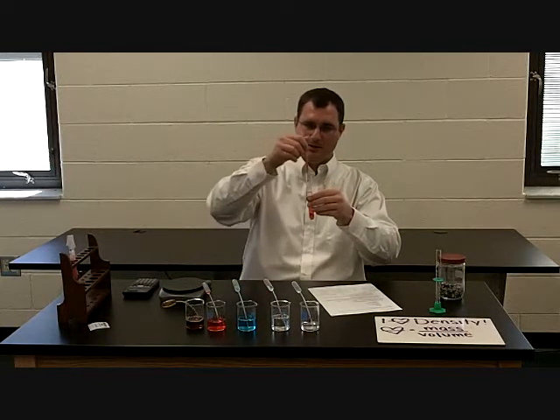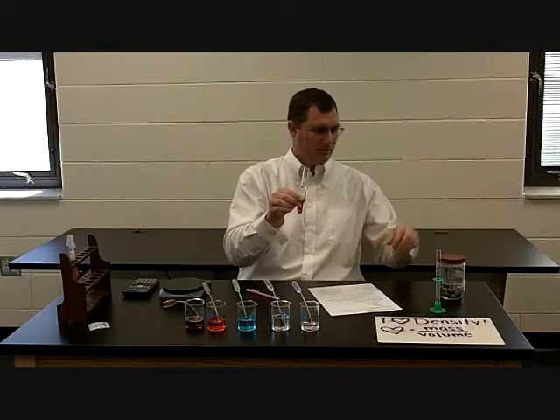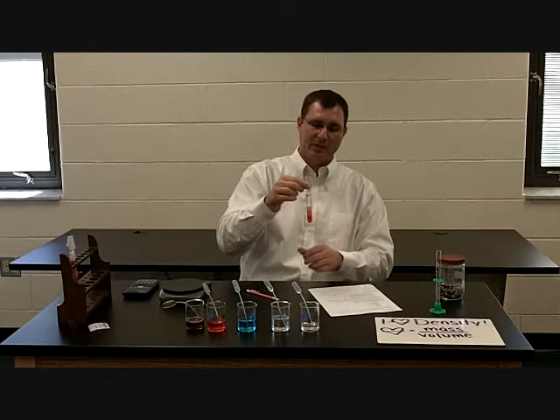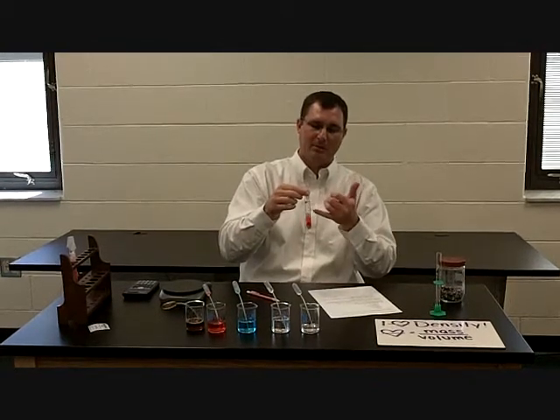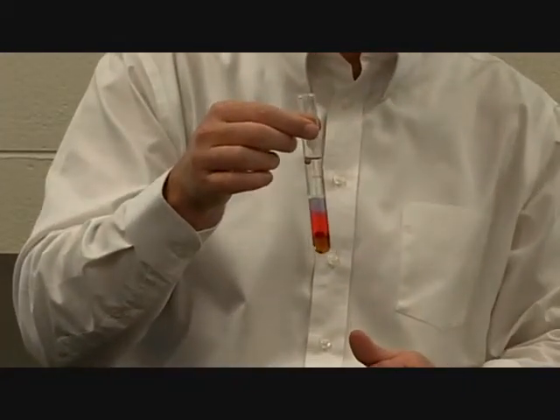That didn't go as planned, did it? Let's push that down there. There we go. And that one's not very dense at all. It's sitting on top of the alcohol. So they're all different types of beads, and I've had them stop at different places all day, just depending on the material they're made out of. So that's kind of neat.